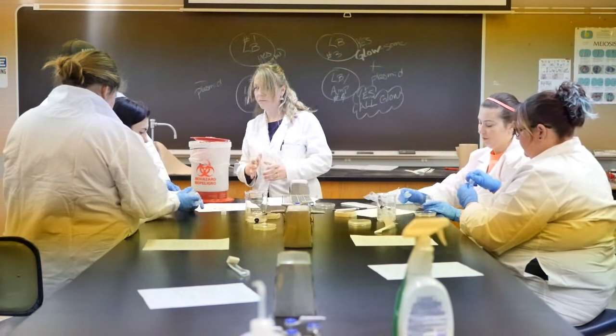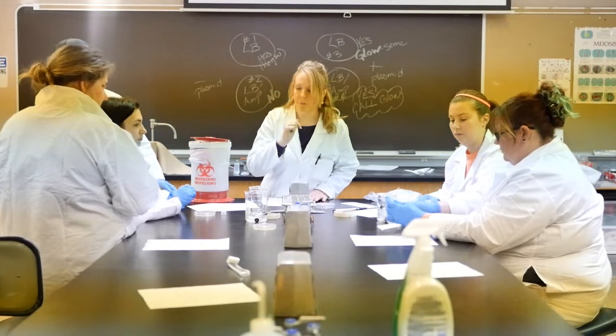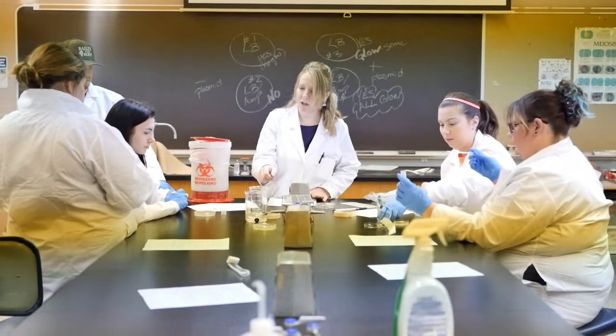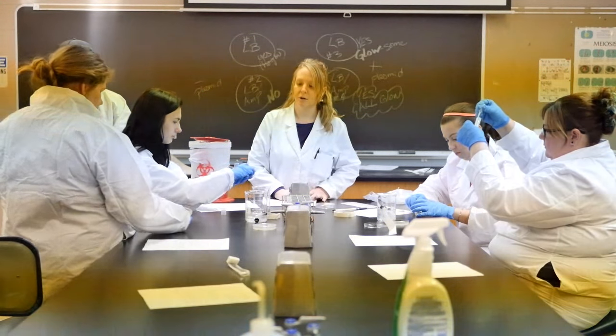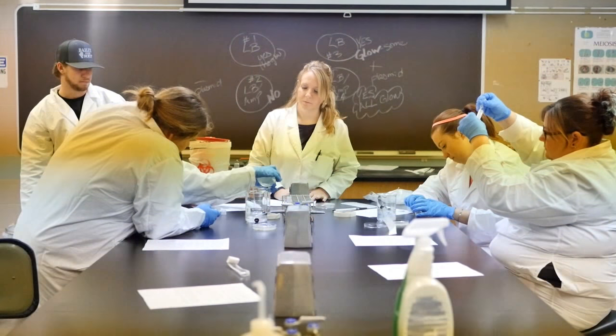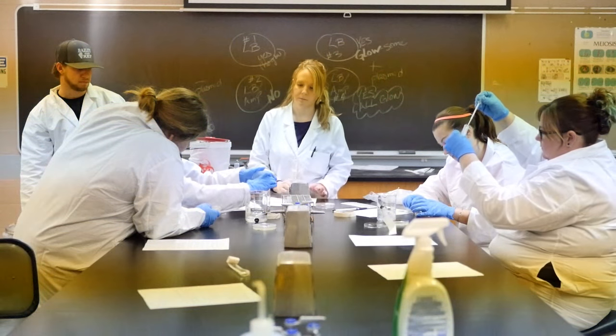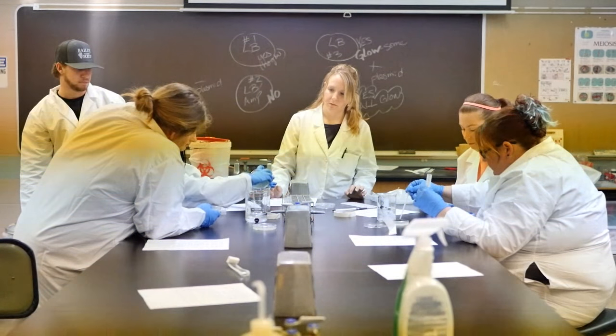Where are the beads? There you go. We have these. All right, when you're done with your beads, clamshell and let them drop into here. Try not to get them to drop on the table, that would be bad. You might have to tap the plate. There you go.